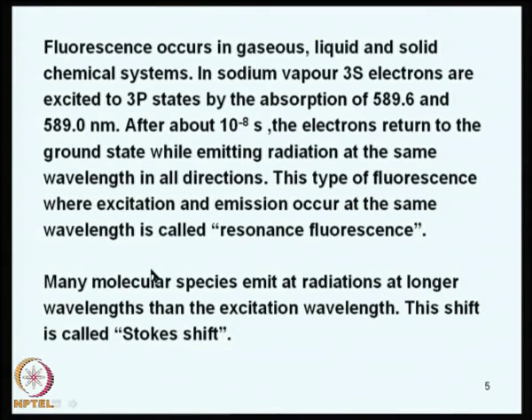And then we have discussed that fluorescence occurs in gaseous, liquid, and solid chemical systems. In sodium vapor, 3s electrons are excited to 3p states by the absorption of 589.6 and 589 nanometers. After about 10⁻⁸ seconds, it returns to the ground state. And if the emission occurs at the same wavelength, then we call it resonance fluorescence. Many molecular species emit radiation at wavelengths longer than the excitation wavelength. This shift is called the Stokes shift.